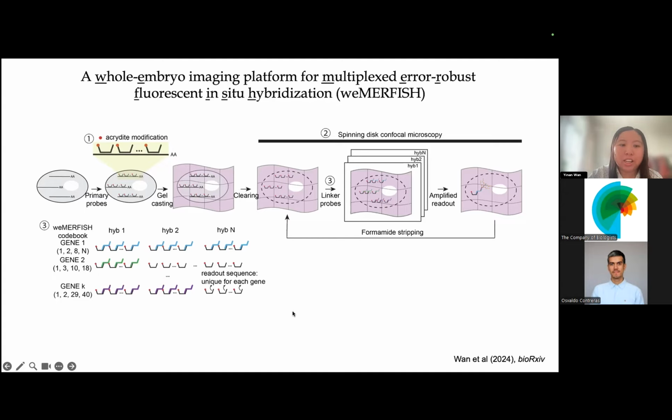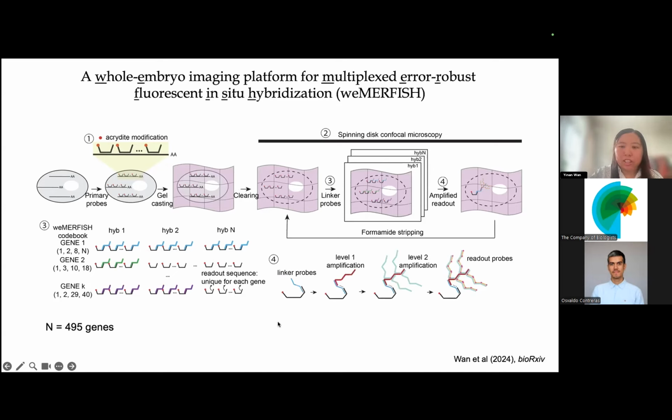we can decode which transcript belongs to which gene. So from the molecular trajectories I mentioned at the beginning, we identified 495 genes that are spatially or temporally variable and designed a library against them. Furthermore, I developed a branching signal amplification approach that boosted the signal by a factor of 3 to combat the signal loss in confocal imaging. Through these 4 points of technological innovation, we were able to achieve high resolution gene profiling in intact embryos.